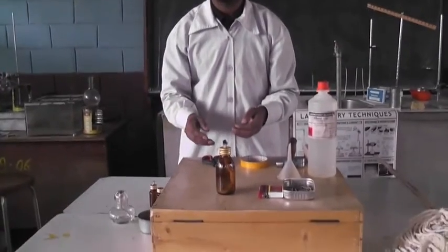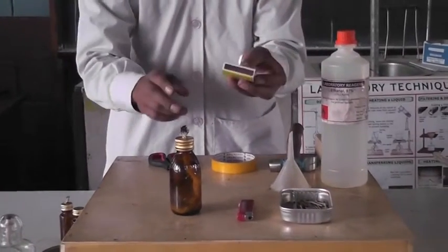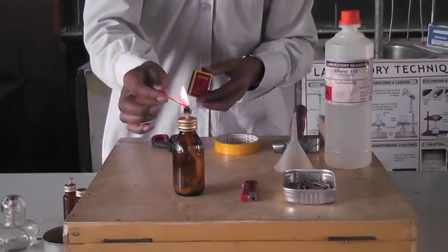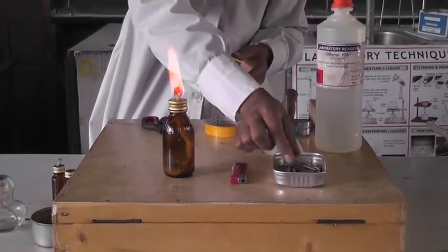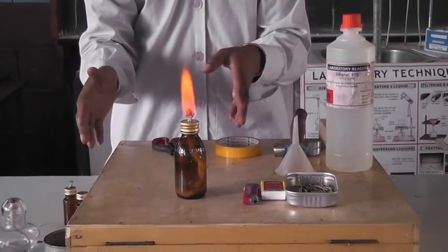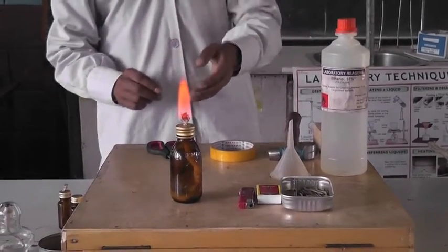This is the alcohol lamp and let's see how to use it. We need a match. After lighting it, we have to put the used match into the trash can. Dropping it anywhere is not good because it makes the laboratory dirty and can cause an accident. So it is important to put it in the trash can.